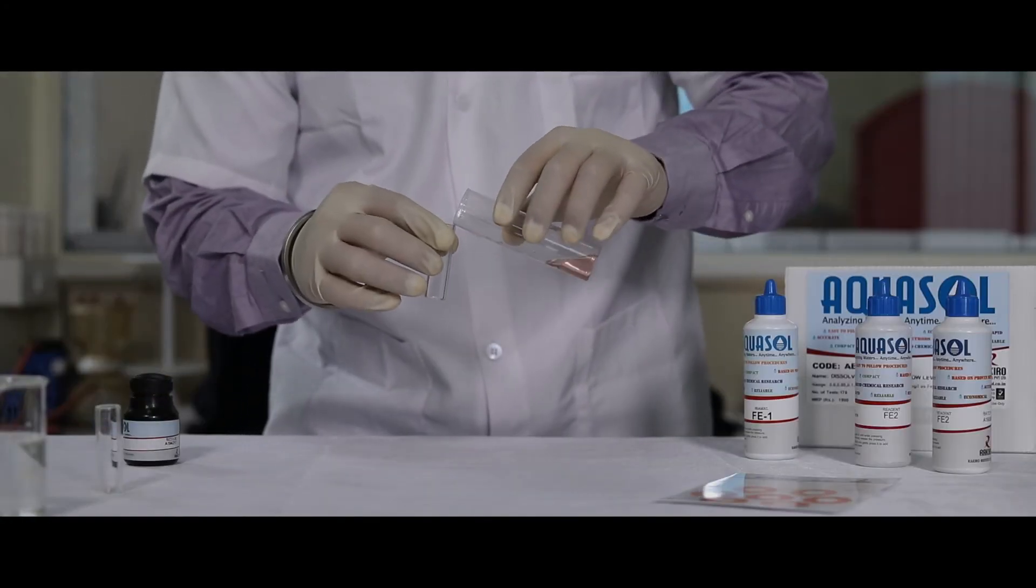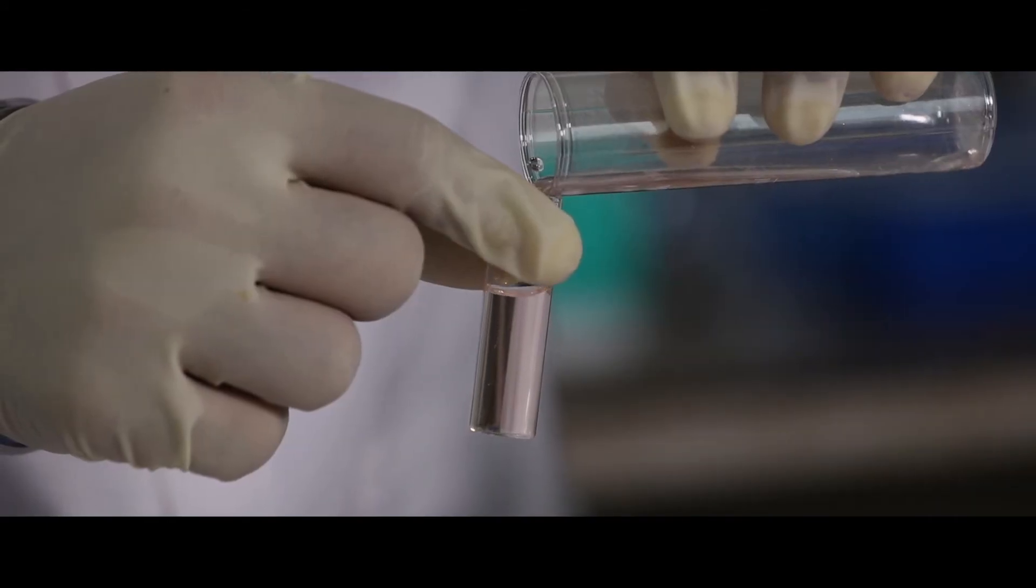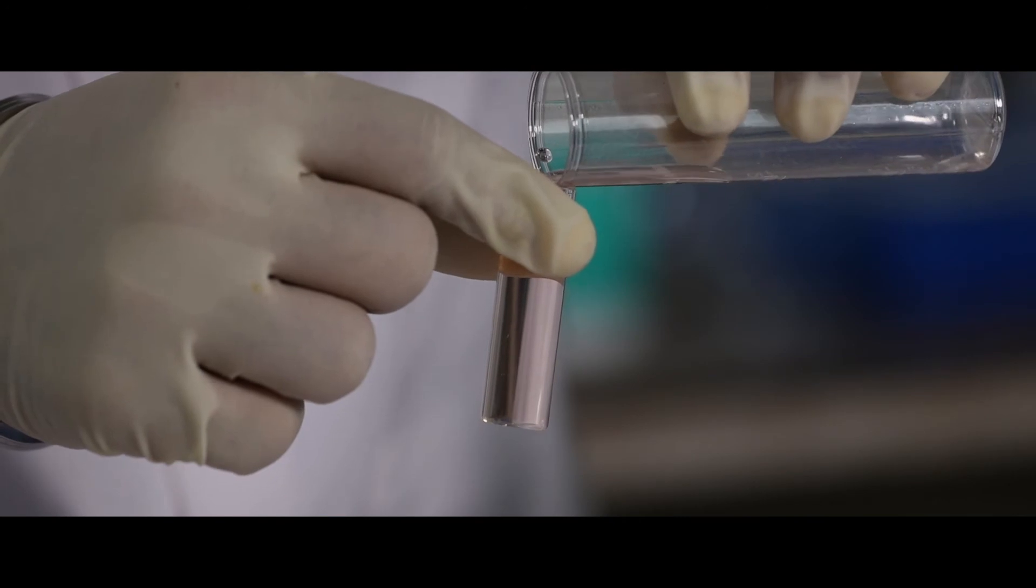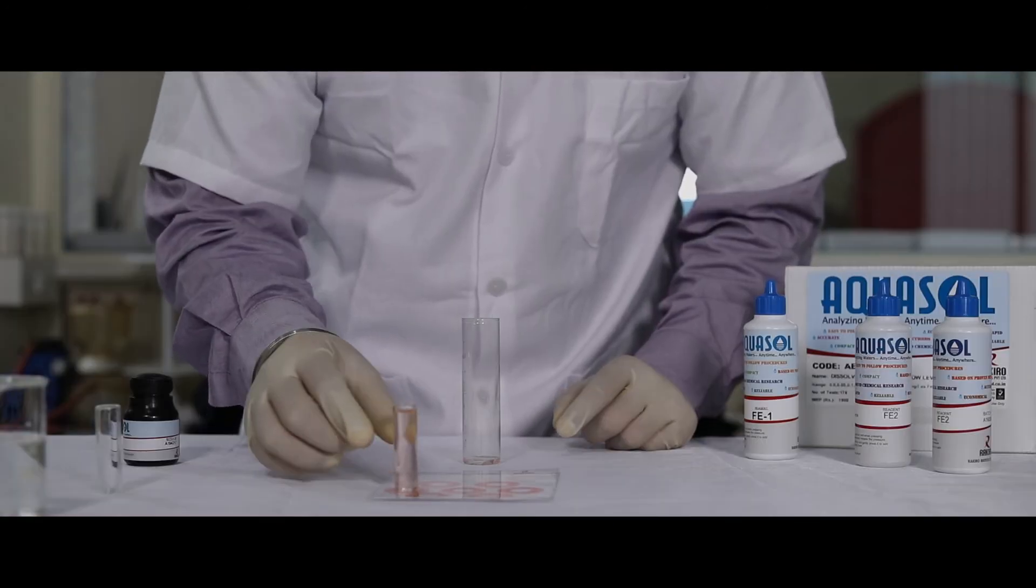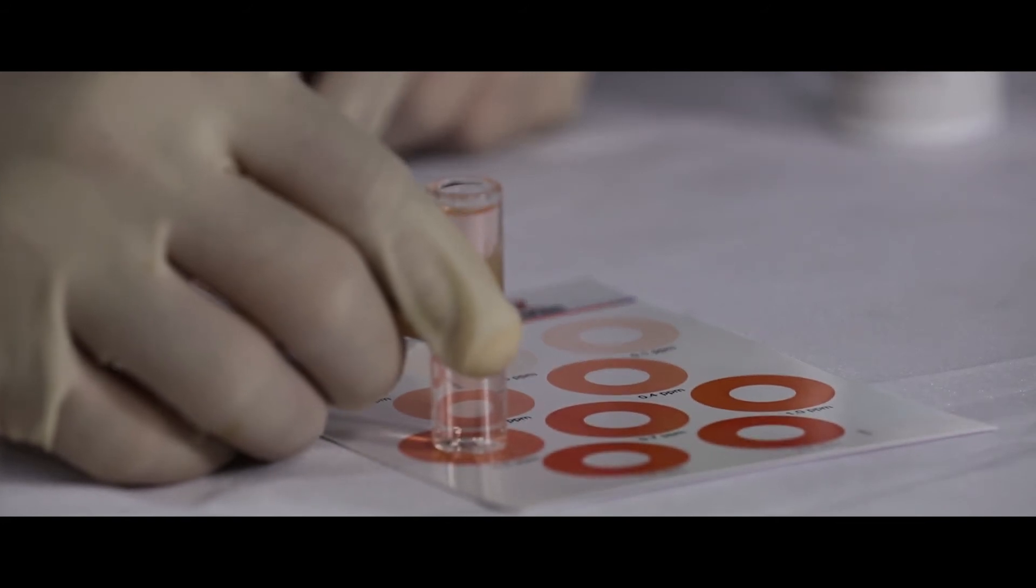Once the color is generated, transfer it to the comparator tube. Place the comparator tube on the white inner circles of the color chart to find the match for your color obtained.